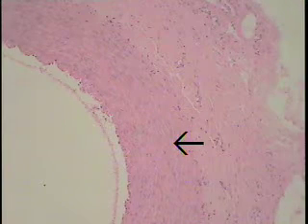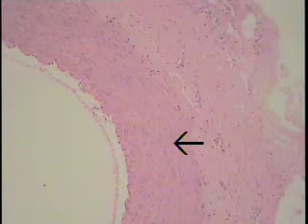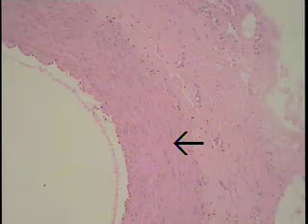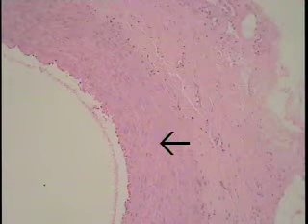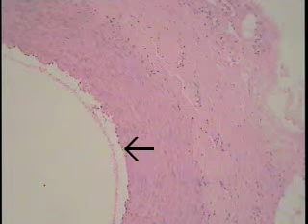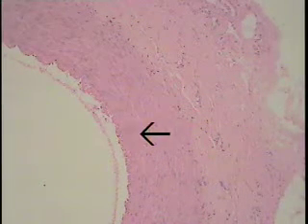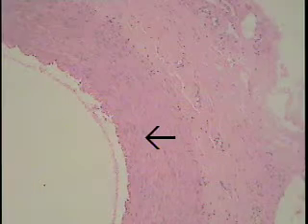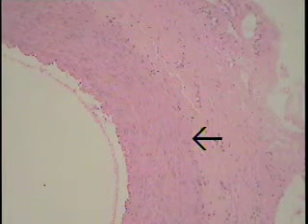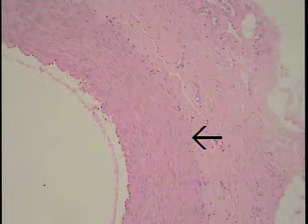This is a section through the wall of a muscular or distributing artery. Unfortunately, you don't have a good example in your slide collection, but nonetheless, let's look at some of its features. It too has a tunica intima shown at the tip of the arrow. The tunica media is almost entirely comprised of smooth muscle and is shown here at the arrow. It extends about this far and dominates the field of view as far as structure goes.